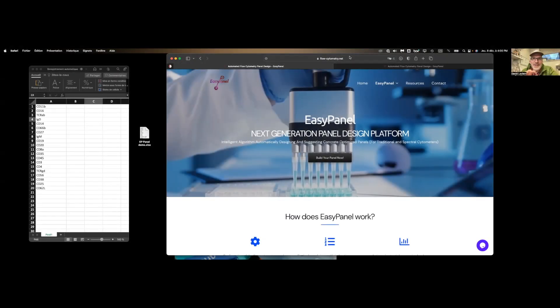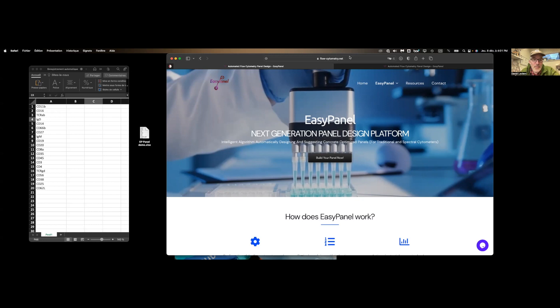Hi, everyone. We're incredibly happy to introduce EasyPanel to the research community on the University of Chicago campus. EasyPanel is an online platform that essentially designs and optimizes your panel for flow cytometry, either traditional or spectral flow.